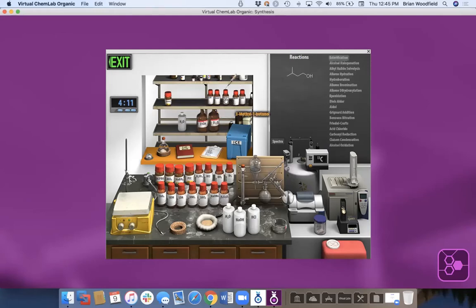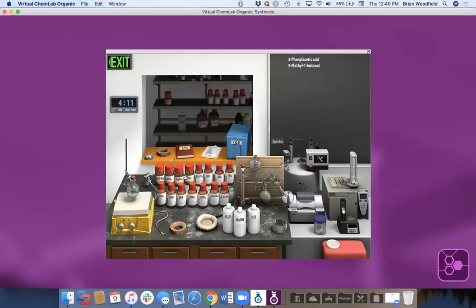Let's say for example that they came over here and then I add my trace amount of sulfuric acid, and let's say they didn't do anything. I just press start and then they said, oh, I'm done, right? But they're not done.